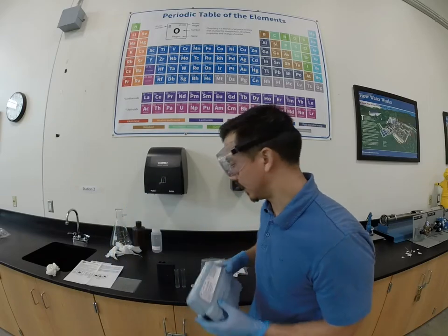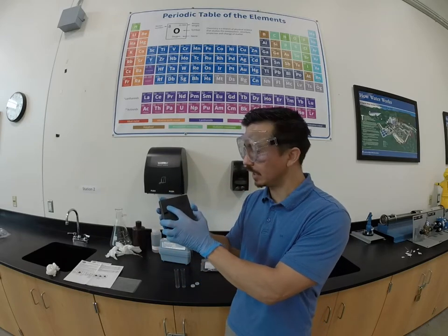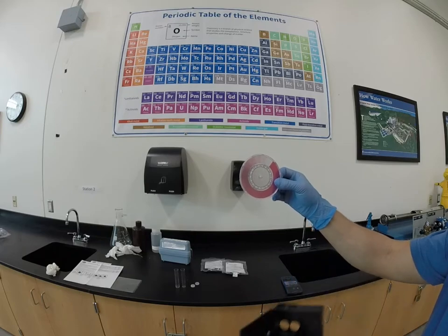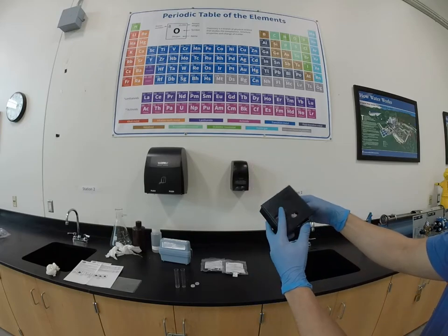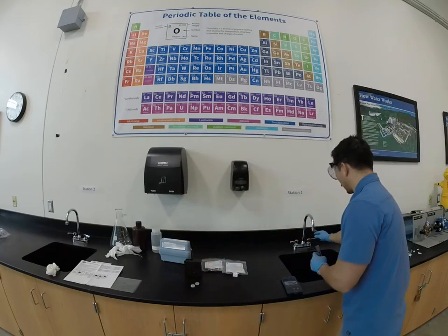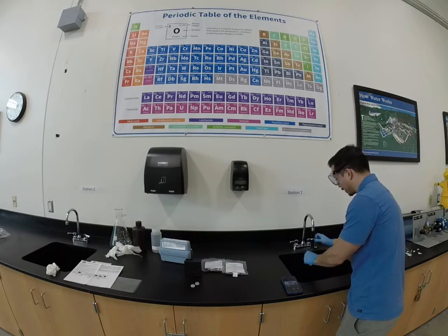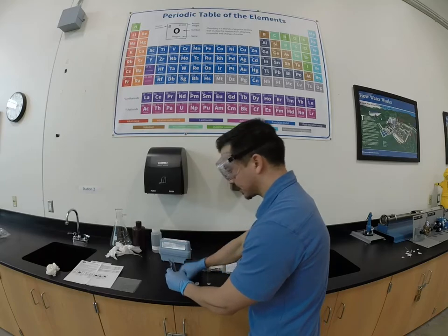We're going to be testing free chlorine today. This is what our comparator looks like. Inside here is a color wheel that shows different colors — the darker the pink color, the higher the chlorine in our sample. We're going to take two samples from our water sample. One of those is going to be our blank — just water with no reagent — so we're comparing against the actual water sample.